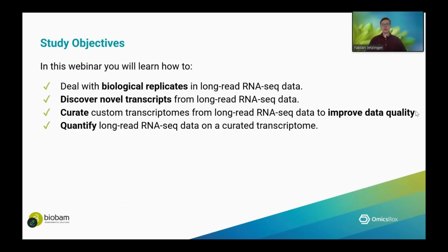So the study objectives for this webinar are to learn how to deal with biological replicates in long-read RNA sequencing data, to use such data to discover novel transcripts, as well as curating your custom transcriptome in order to improve data quality. And finally, we will quantify our data on this curated transcriptome and use the quantification to conduct differential expression analysis.